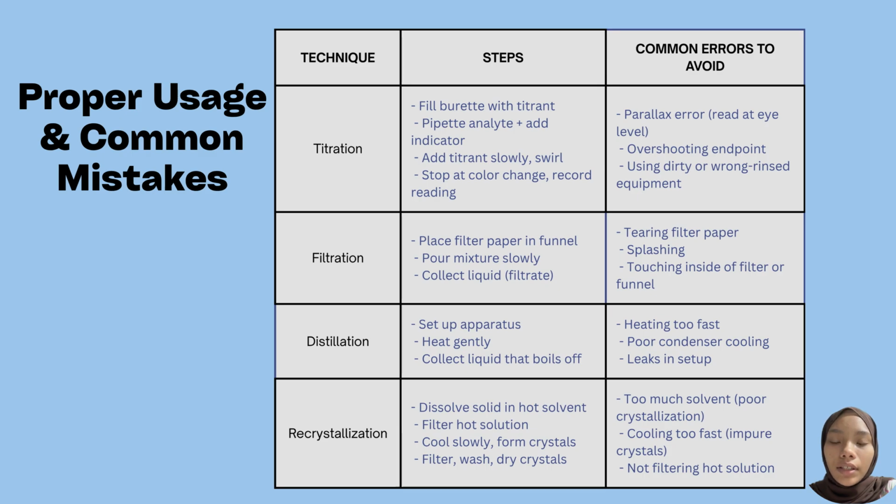The first step for recrystallization is to dissolve the solid in hot solvent. Next, we need to filter the solution and let it cool slowly to form crystals. Filter, wash and dry the crystals.